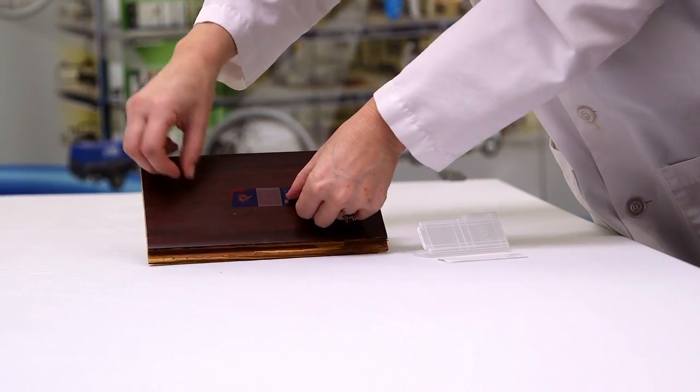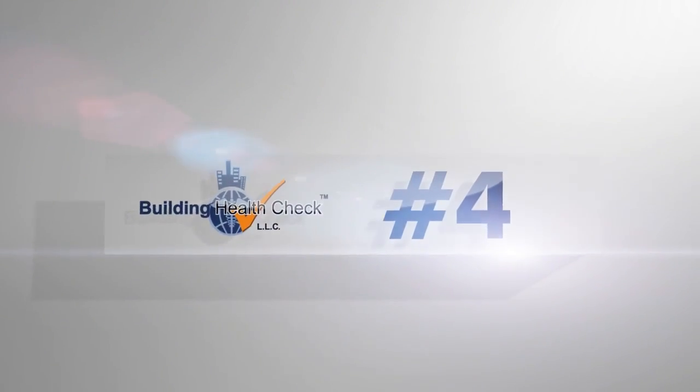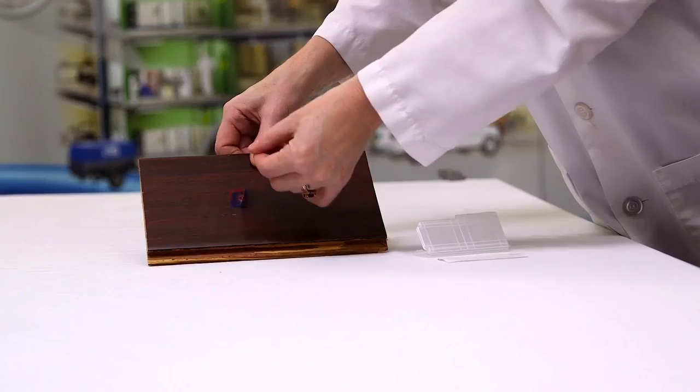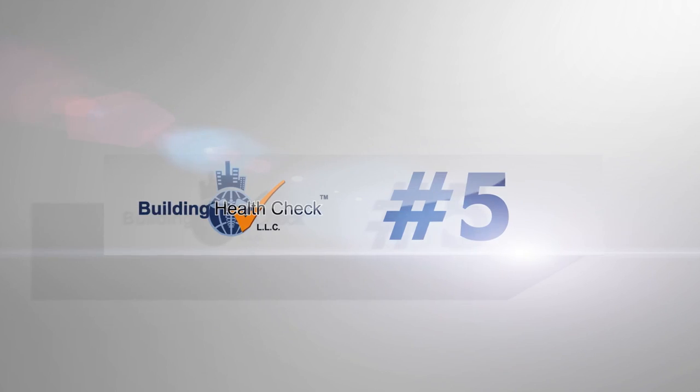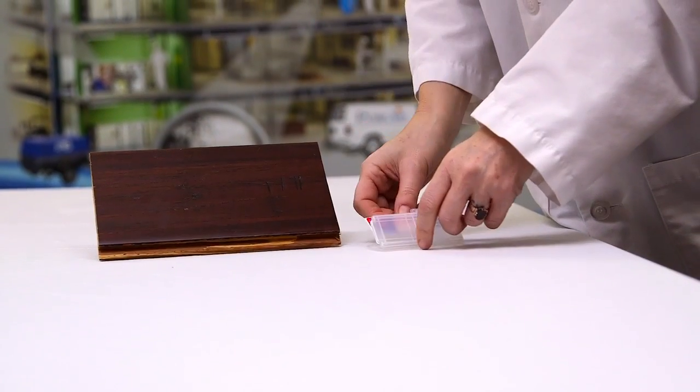Do not touch the red grid with your fingers. Only apply this red grid to the surface you choose to sample. Gently touch the surface you are testing. Step 4: Once the sample is taken, reapply the Bioscan 400 to the wax paper backing. Step 5: Place the sample back into the small plastic case.